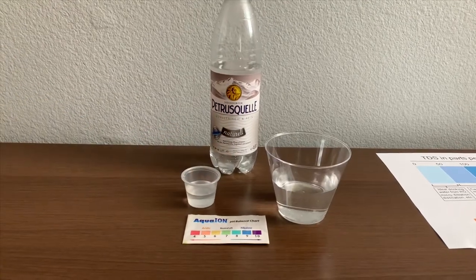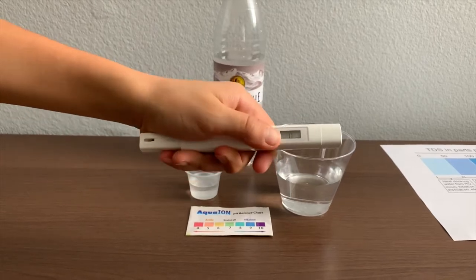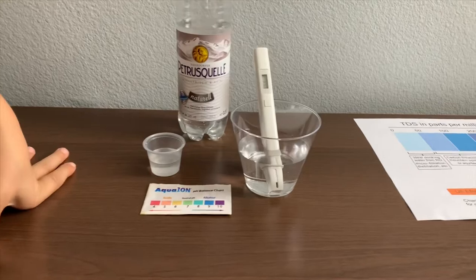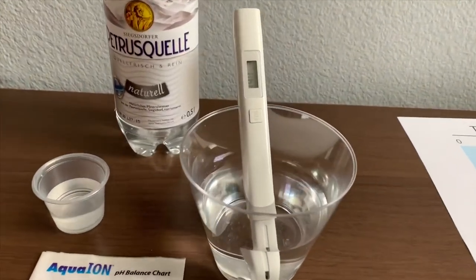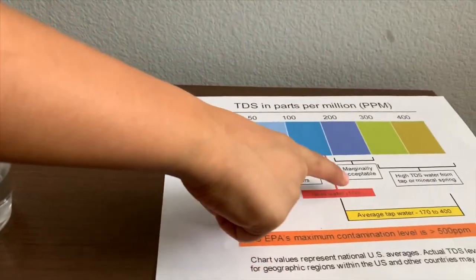First, let's test the TDS level. Turn on the TDS tester, make sure it says zero, and put it in. 340 — that is high TDS water.